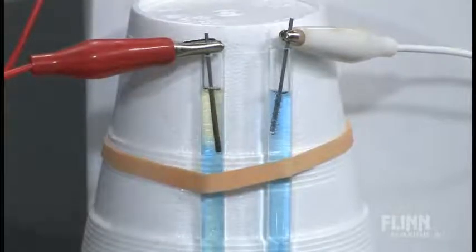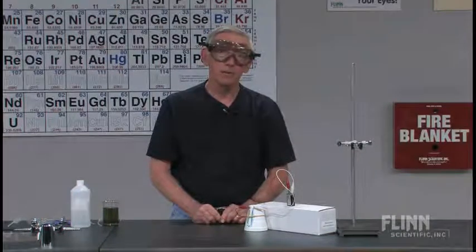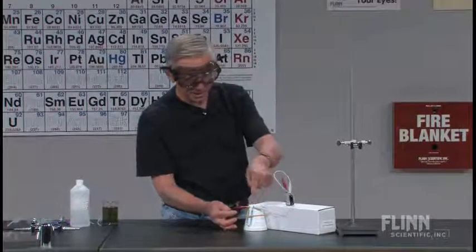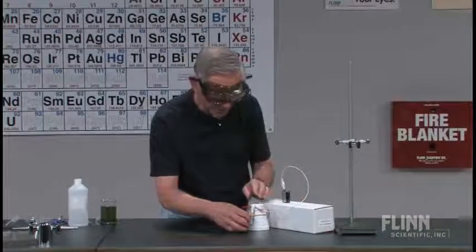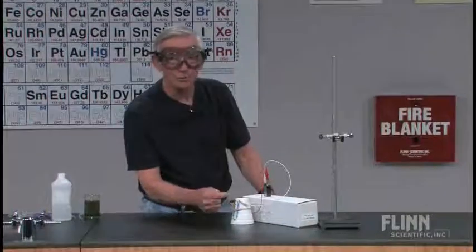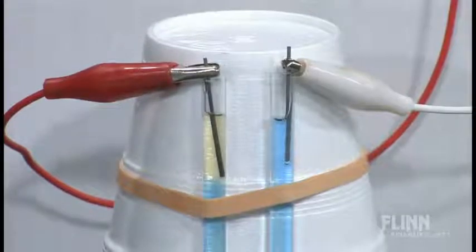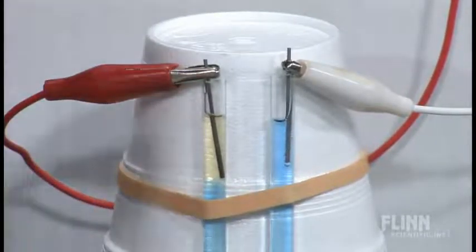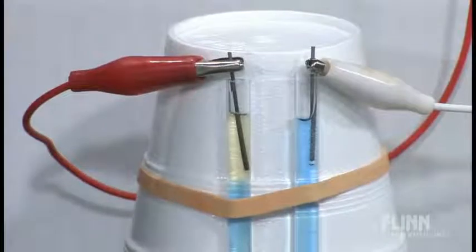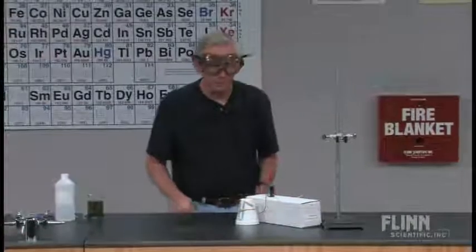And one of the things I tell my students, who see this takes no time at all, is to see if you can reverse whatever happens at first. If I take this out and put it here, take this out and put it there. One of the nice things about this is such a small tube that the liquid stays in. It goes fast enough you can actually reverse the process and have the yellow side start to turn back to blue, the blue side turn back to yellow. Okay, good. So let's now go see if we can figure out what's going on.